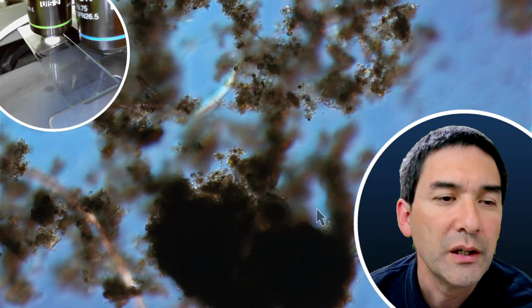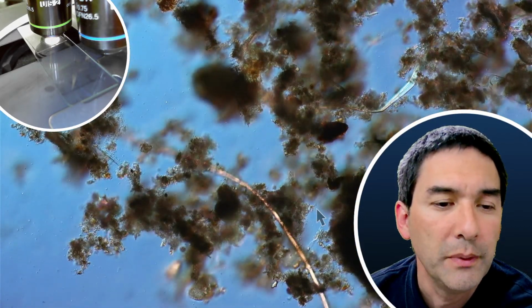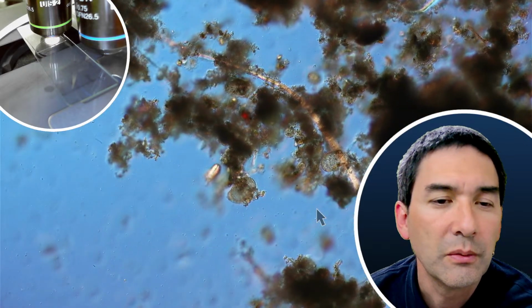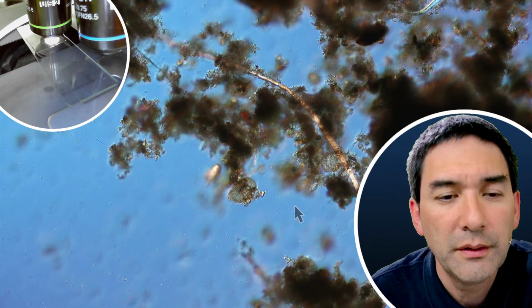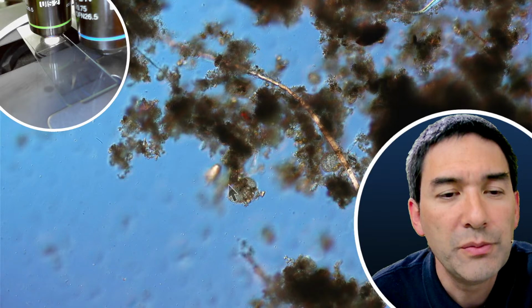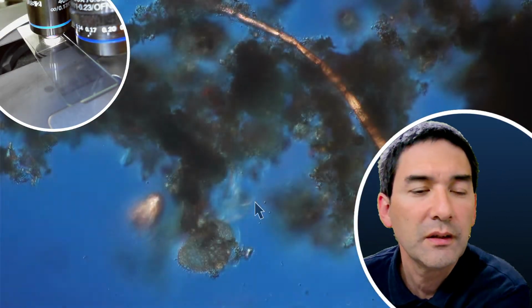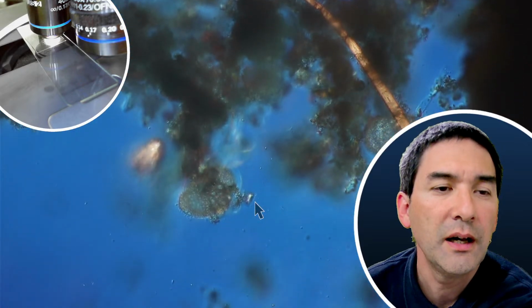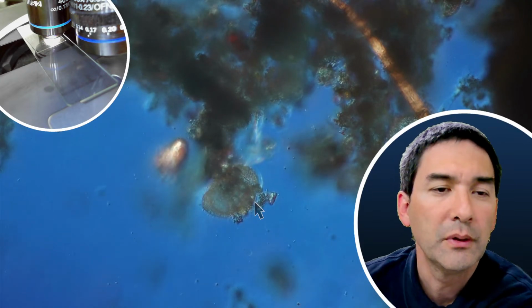Wind, of course, and I've seen today in the morning, at least in my other slide, quite a few pieces of... here it is, here we go. Okay, so maybe you can identify this here. I've seen also more of those. Maybe we go up with the magnification a little bit. What could this be? This is actually a little bit covered up, but very evident. I don't know this species, but this is a plant pollen. The pollen, a pollen grain.